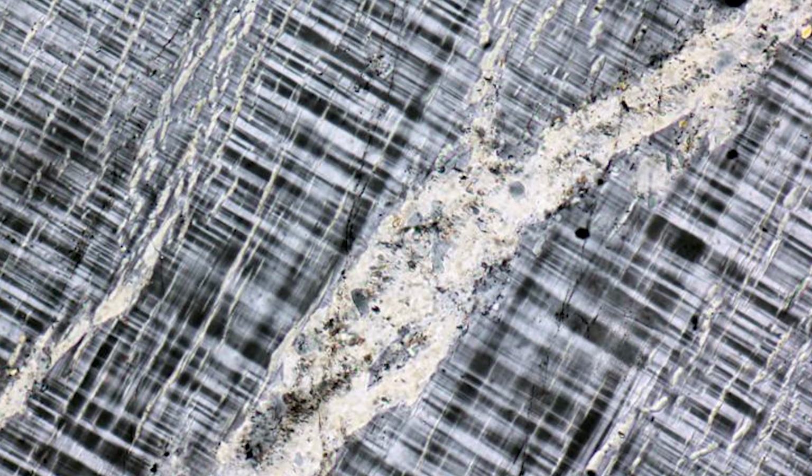Some minerals may also exhibit exsolution, which is just small crystals of another mineral embedded in the crystal due to an incomplete solid solution. This is common in alkali feldspar such as this perthite, that contains exsolution lamellae of plagioclase.